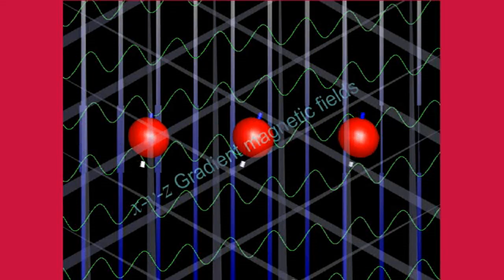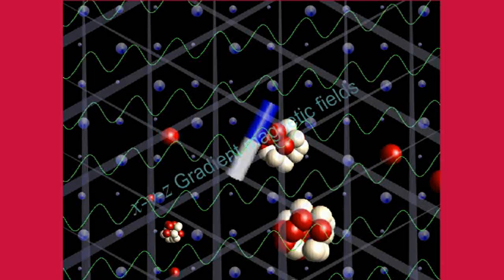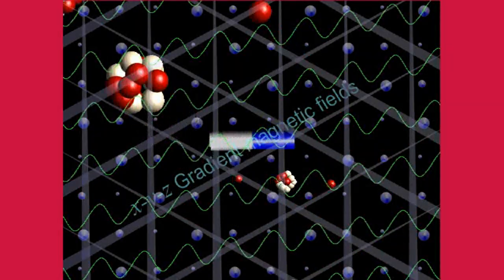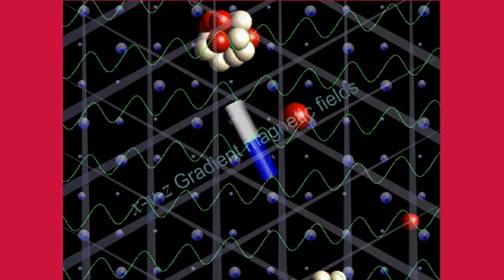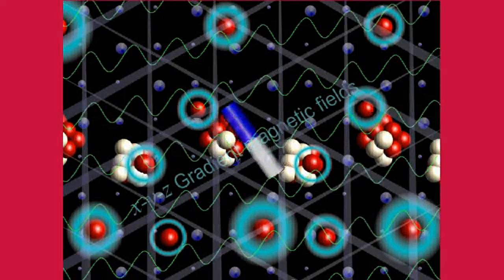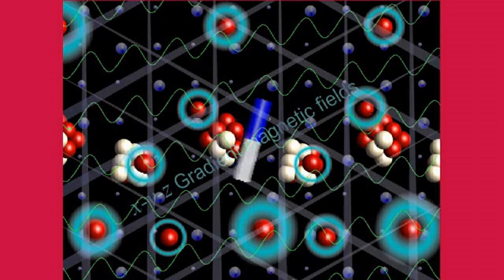When the molecule is small and the movement is large like a water molecule, the difference in the strength of the magnetic field is averaged over time. So it is difficult to make a difference in the speed of rotation, and the signal does not weaken easily. Therefore, the signal from the proton of the water molecule is relatively strong. On the other hand, in macromolecules such as fat, a certain proton is greatly affected by the surrounding protons.